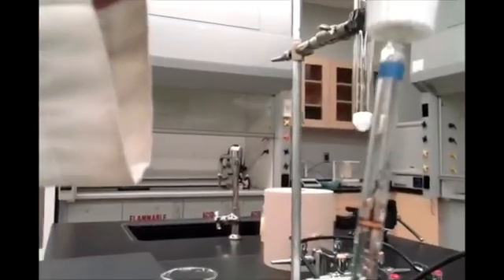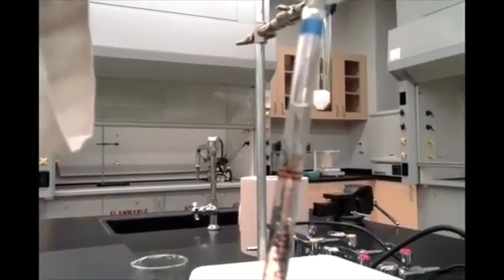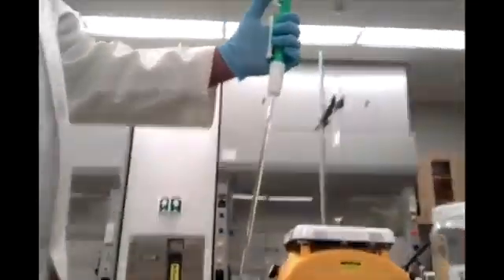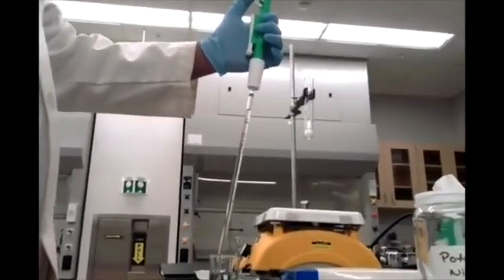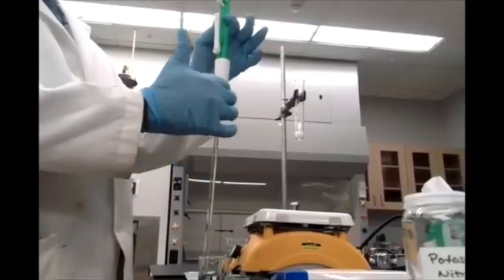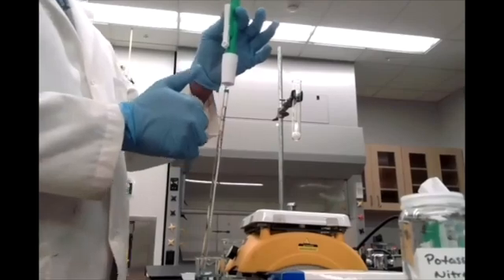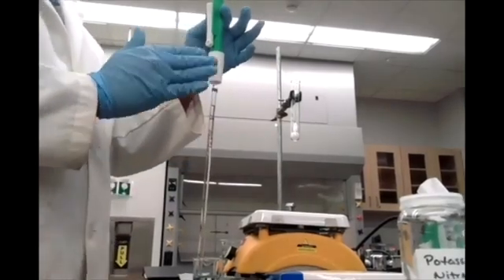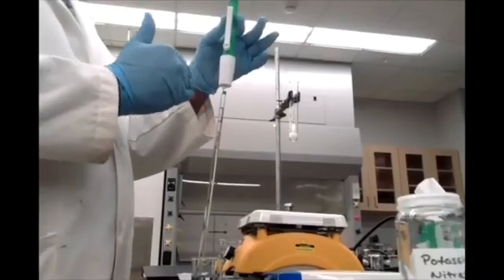I'm going to avoid pulling all of the water up into the pipette bulb itself. Very carefully, I'm going to clamp my thumb on top of the pipette opening, and air pressure will basically keep the water level more or less steady.